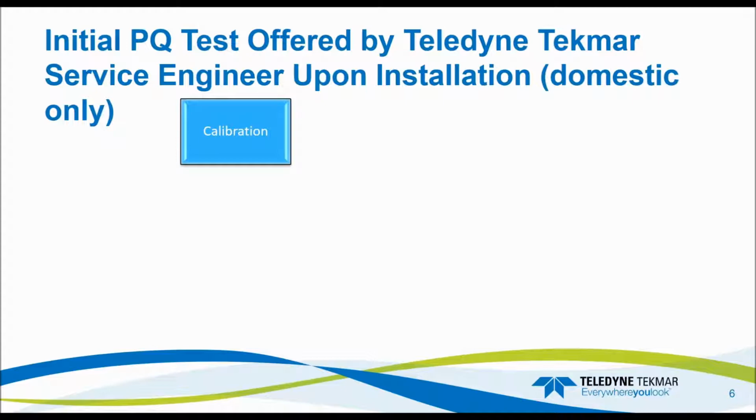So we do offer an IQ, OQ, PQ with the Fusion. That is an option. One of our service engineers will come out and perform a series of tests. One of those tests is a calibration curve, of course. So they check the linear regression value, to make sure that is good. The M value or the slope value, to make sure that's high enough that you're getting enough response from that detector, and the B value is low enough. The B value represents the background of the instrument. So if that's high, that's a sign of contamination, things like that.